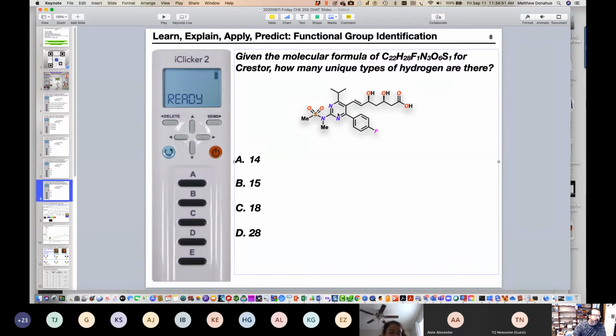You look this way, you see that ring. You look that way, you see that other sp2 hybridized carbon with its substituents. Now, if you're standing here, you see that hydrogen, then you see the rest of this chain. Then you see this other sp2 hybridized carbon of the pi bond. So the fact that when you're standing on either of those and things look different, that means they're different.